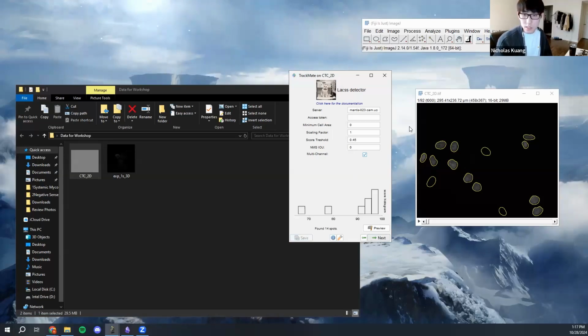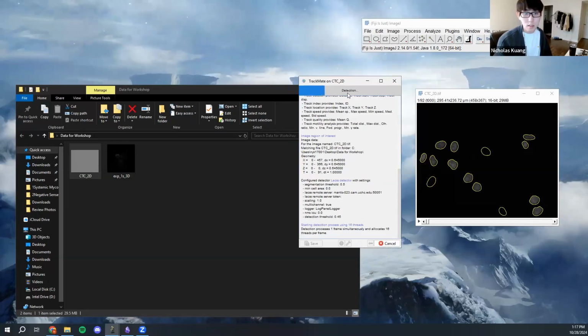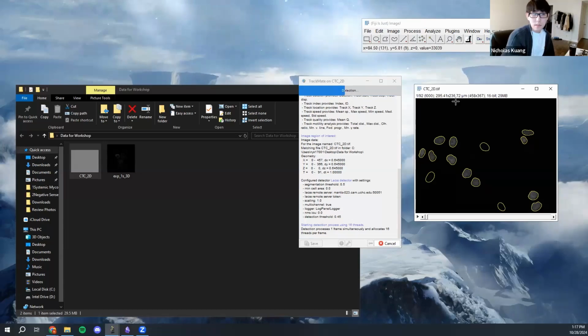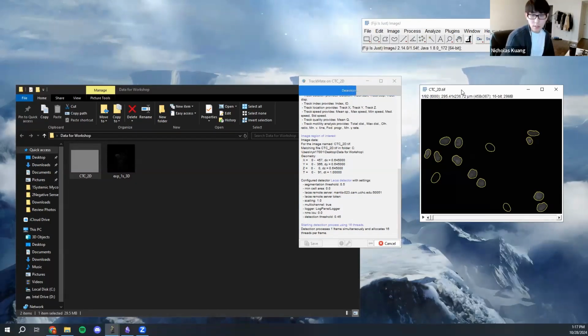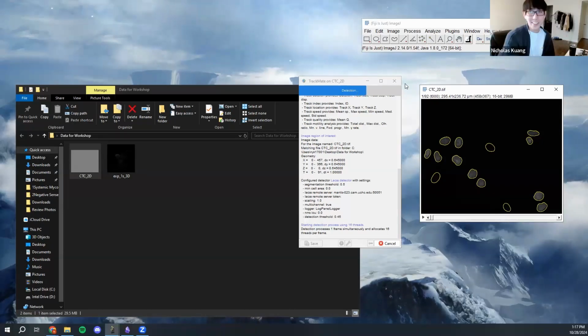But if we click next to proceed through the entire data set, you actually see some of the perks that we mentioned before, that our LSS model is actually very fast, even with not the highest end backend. I believe the stats are 5 seconds per image, right, Dr. Yu? No, 5 frames per second. Sorry, 5 frames per second.